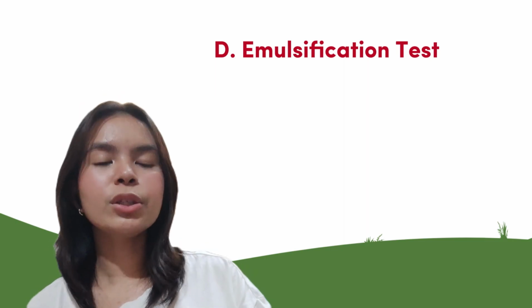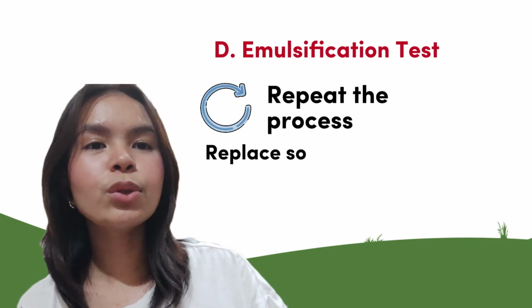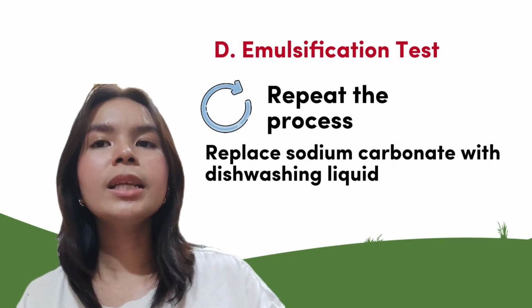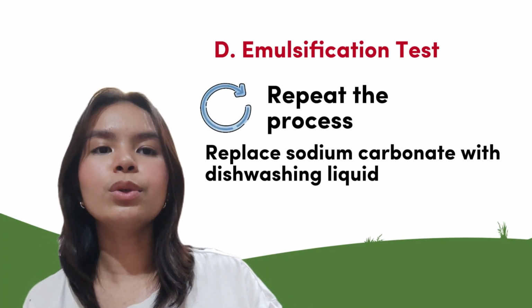For the last procedure, we are going to repeat the process, but we are going to replace the sodium carbonate with dishwashing liquid as an emulsifier. And an emulsion is formed if the lipid disperses evenly in the water, creating a cloudy solution.